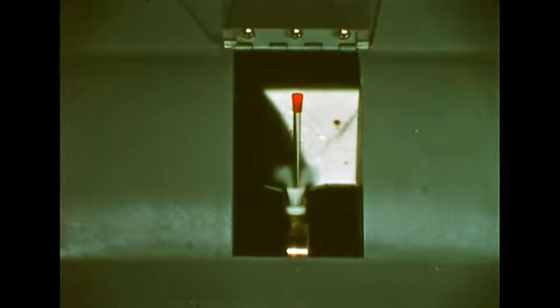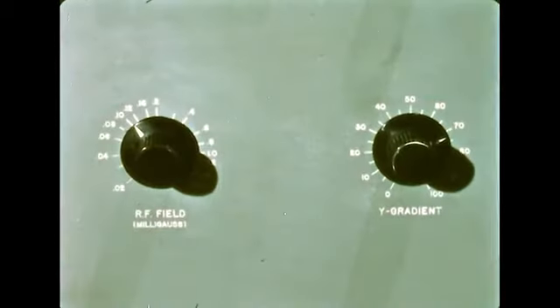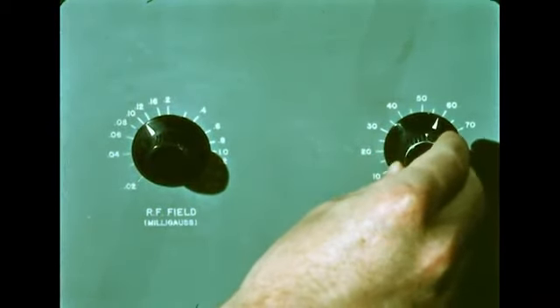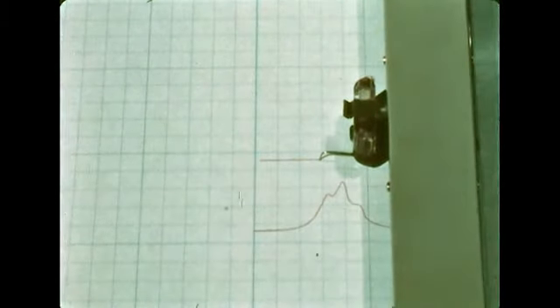Before we take a spectrum, we must adjust the instrument. This is the methyl triplet of diethyl ether. The spectrum appears to be very broad, which means that the magnetic field is not the same in all parts of the sample. To correct this, the magnetic field homogeneity is adjusted. Since all parts of the sample now feel the same magnetic field, the peaks become sharp.